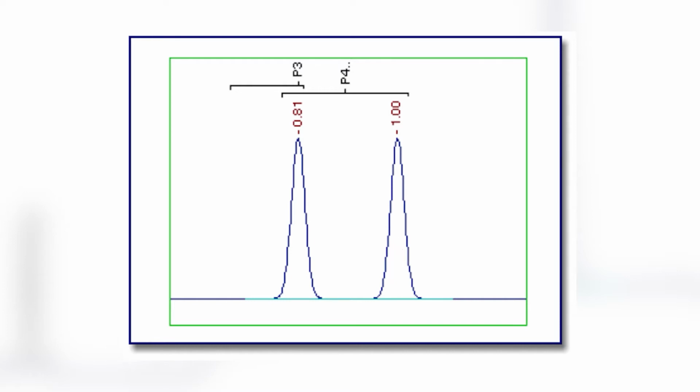If the first peak were to elute earlier, say at 0.79 minutes, then it would still be identified as P3, but the second peak would be identified as P4 because it is centermost. The result is erratic peak identification, which depends on slight differences in retention time, and on the presence of other peaks. For this reason, overlapping search windows are discouraged.